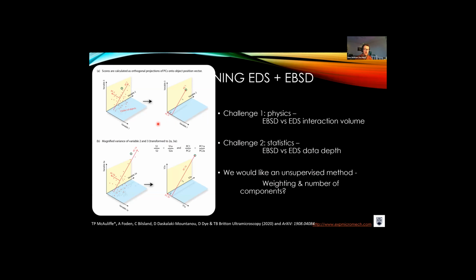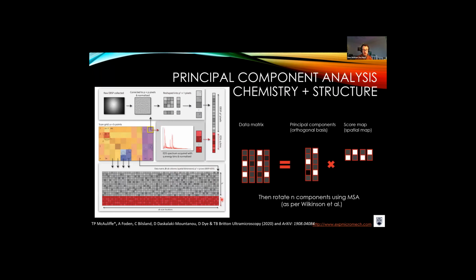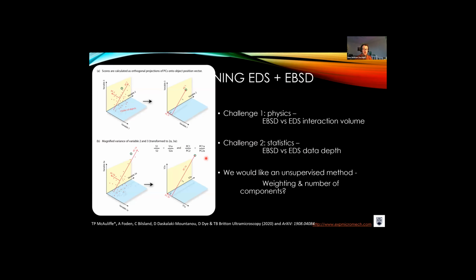So we can think about this in terms of having a small weighting function, W, that says how much EDS signal is present. What we think about is that the PCA is trying to find unique clusters in a data set. So if we think of this simplistic problem where we have 3 different measurements of properties, and the EDS signal is, for instance, variable 3, the weighting function W stretches this axis up and down.